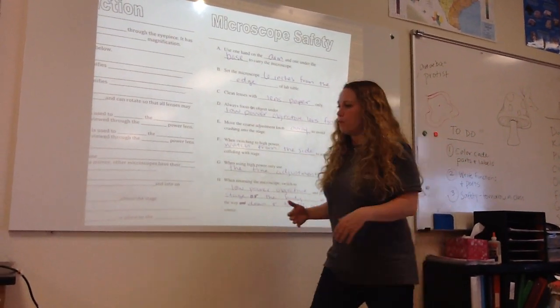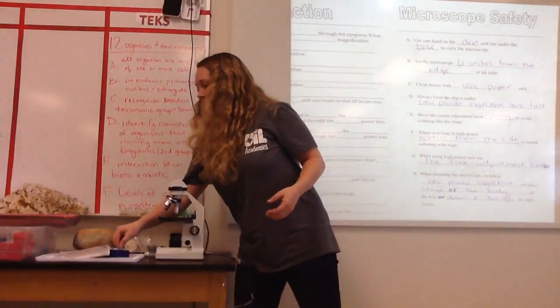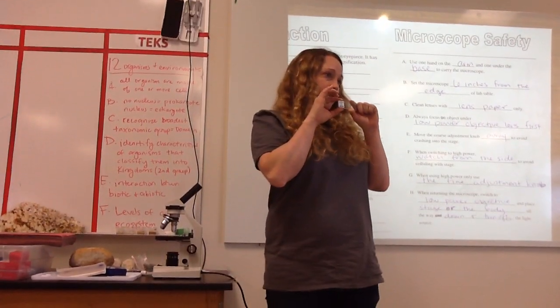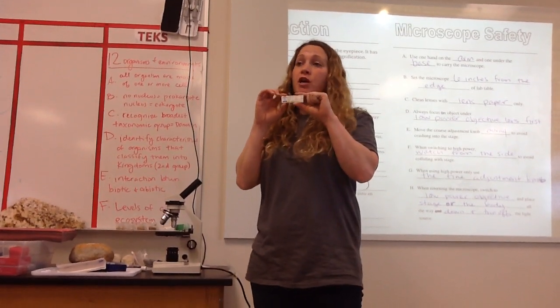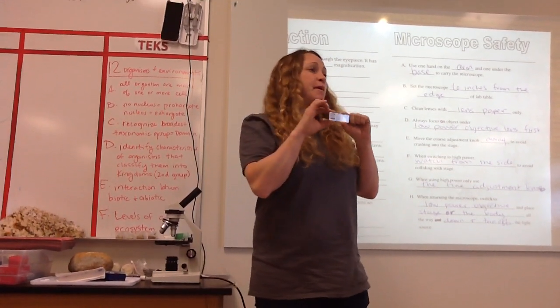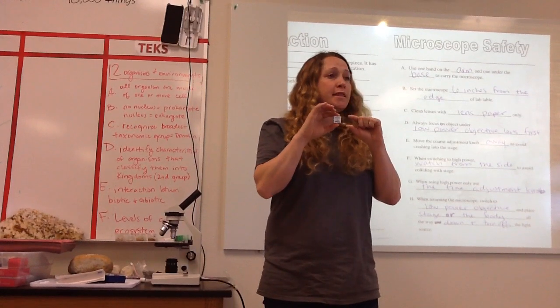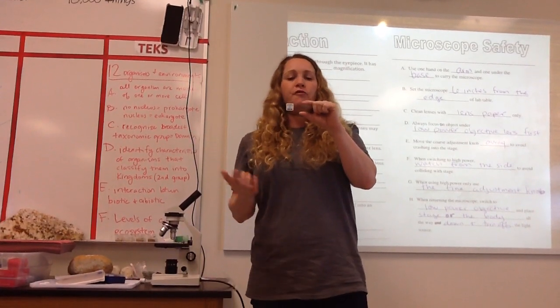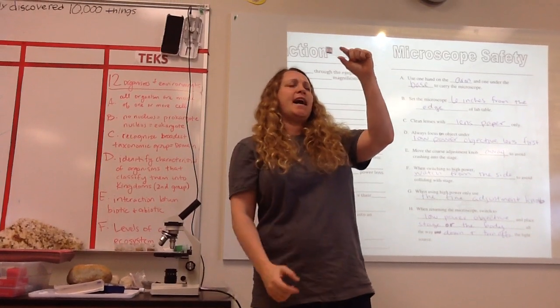So what you'll do is you'll find a slide. A slide is a tiny piece of glass, very breakable. It's glass, so if it breaks, it gets a little sharp edge. It can cut you pretty easy. These slides have been prepared ahead of time. We're not making them. They are different objects. You'll get to see a bunch of stuff. But it's very tiny. It's dyed.